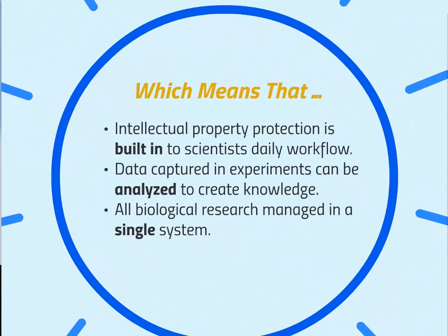So what does that mean? That means that your intellectual property is protected and it's built into the scientist's daily workflow. The data is captured in experiments and can be analysed to create knowledge, and of course the structured data is also captured to allow you to be able to search and mine that information as well. And all of your biological research can be managed in this single ELN system.